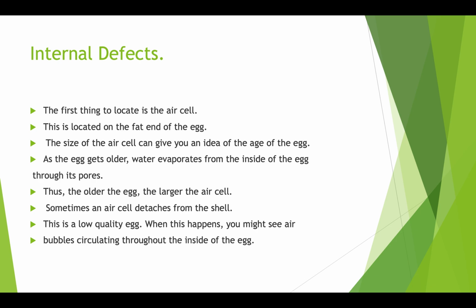Sometimes an air cell detaches from the shell. This is a low quality egg. When this happens, you might see air bubbles circulating throughout the inside of the egg.